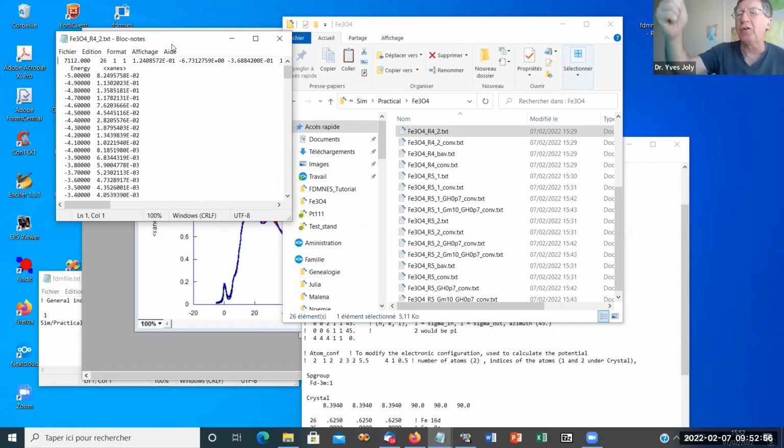Indeed, if your metallic atom, for example, loses some electrons to the neighboring oxygen, the potential decreases, and so the core level decreases in energy also. And so you need more energy to go up to the final state. So it means that to make the comparison, you need to consider also the shift of the core state. Okay? That's possible.